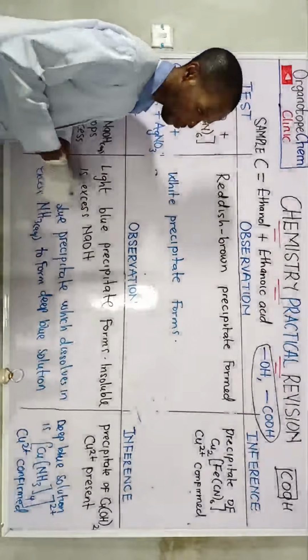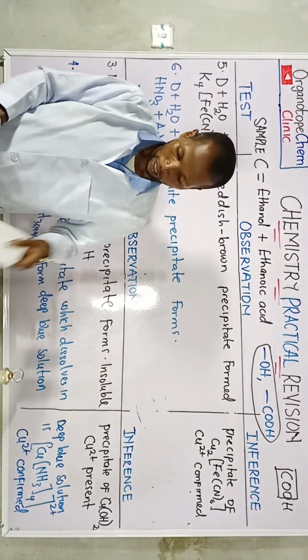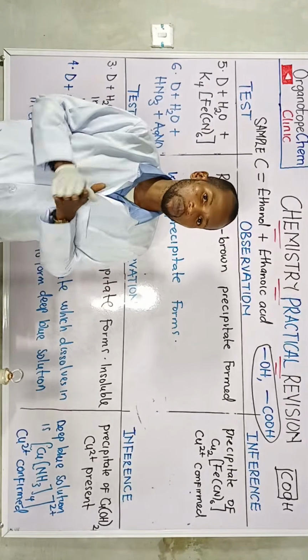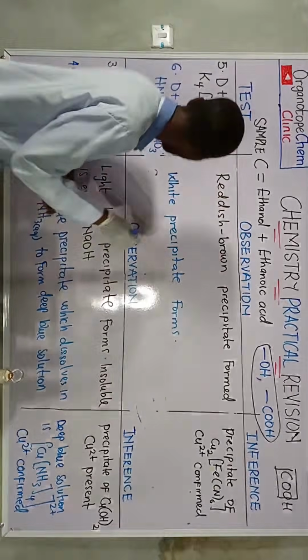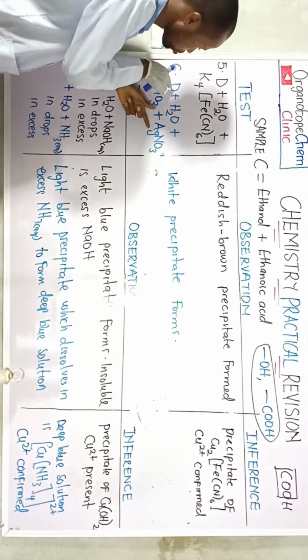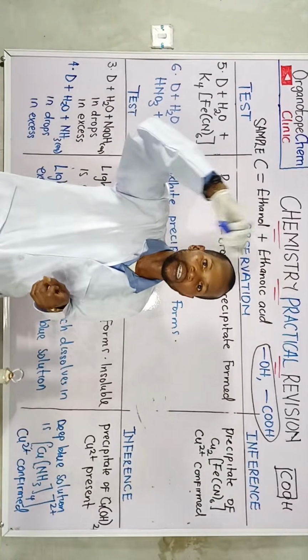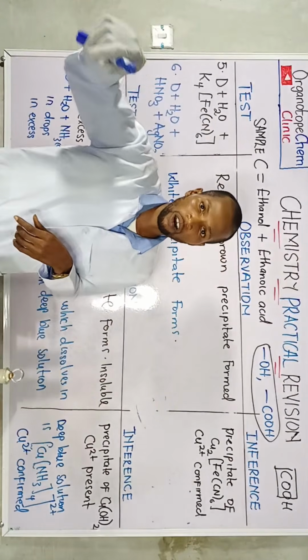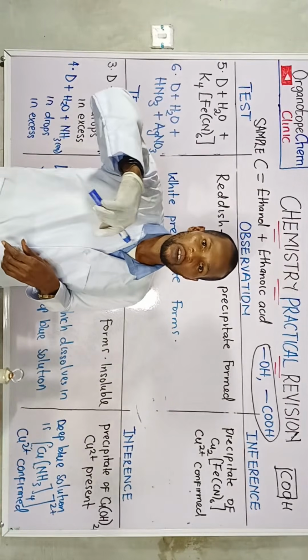Okay. So after which the white precipitate has been formed, can we now add? Yes, we can now add ammonia to the precipitate. What is the precipitate formed? Let's look at this very well. We have AgNO3 right here. It's been added to sample D. The chloride in it will substitute the nitrates in silver nitrate. The NO3 will be substituted by Cl, that's chlorine.